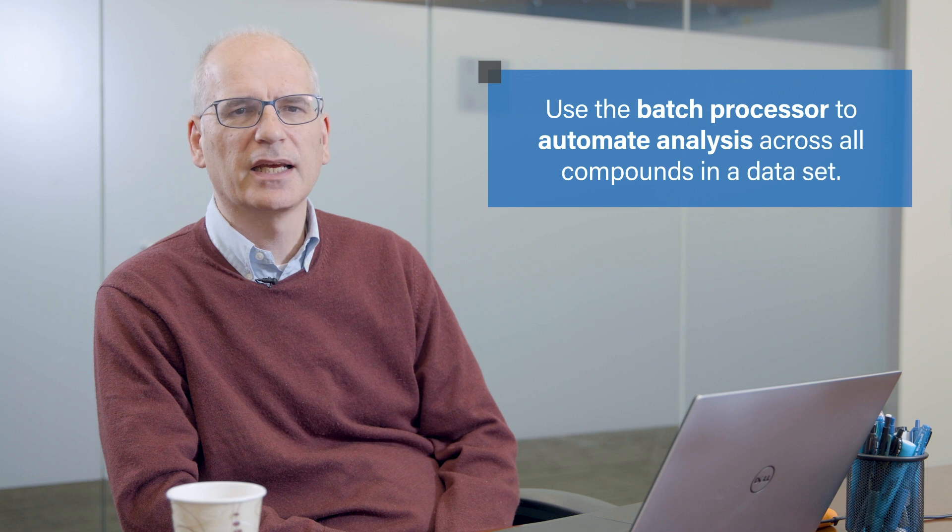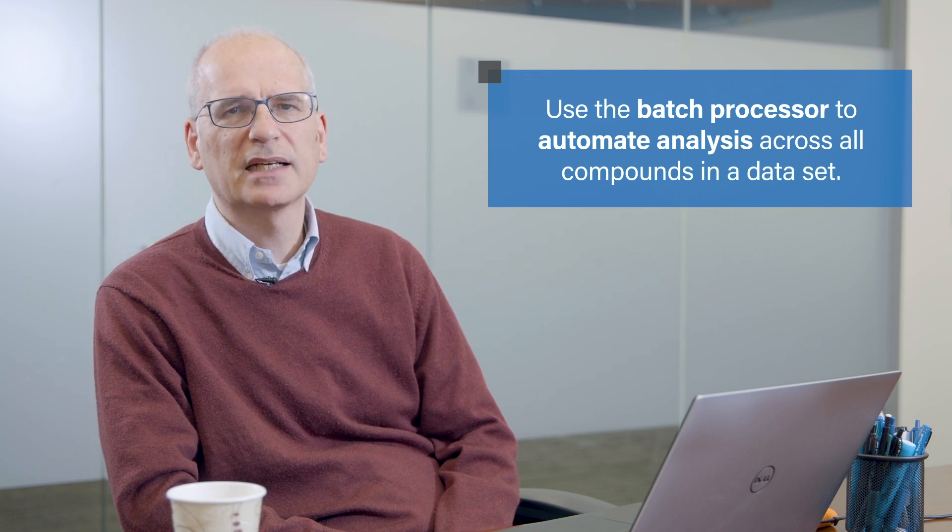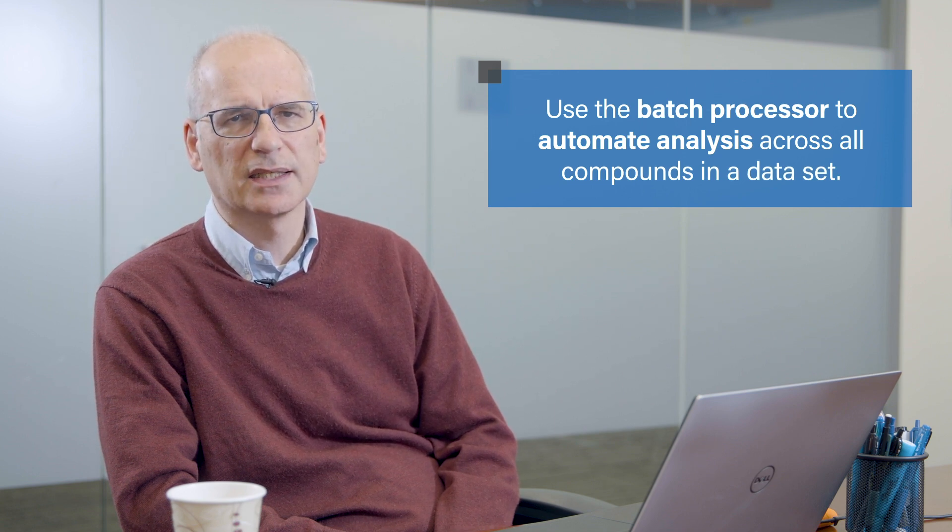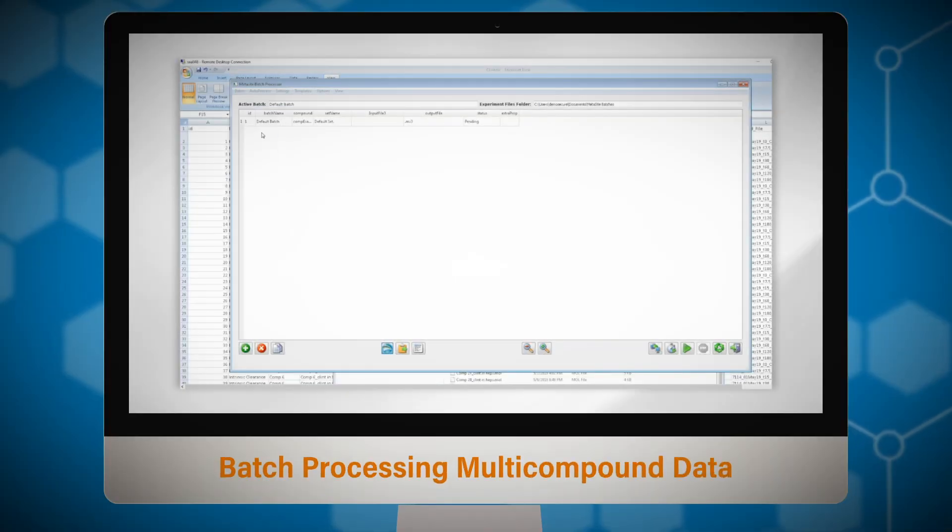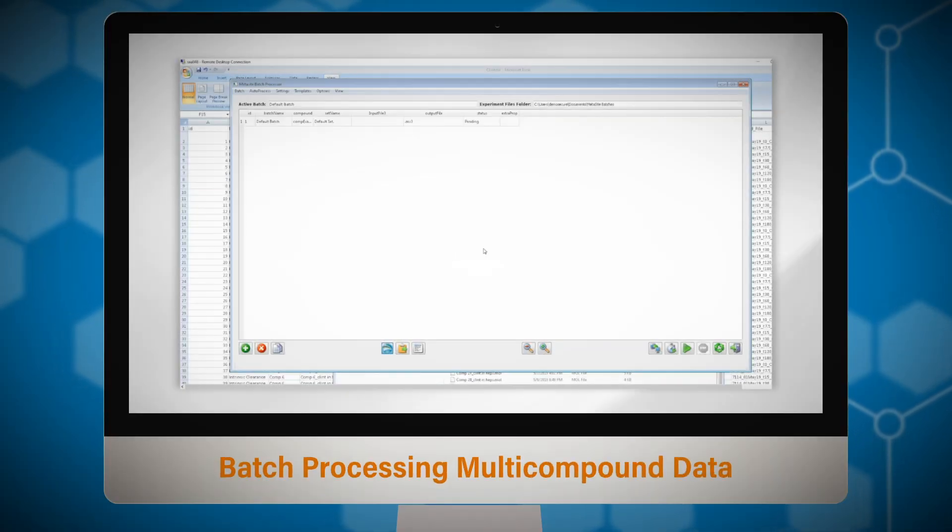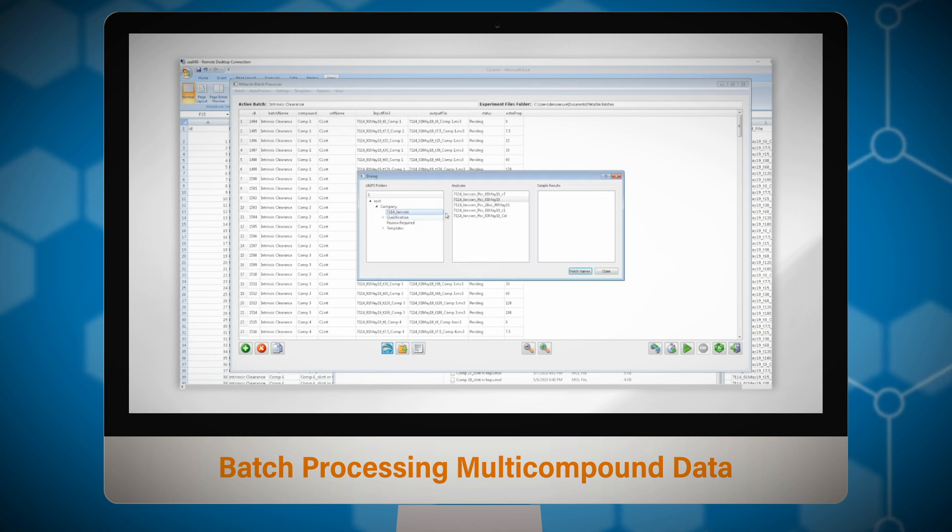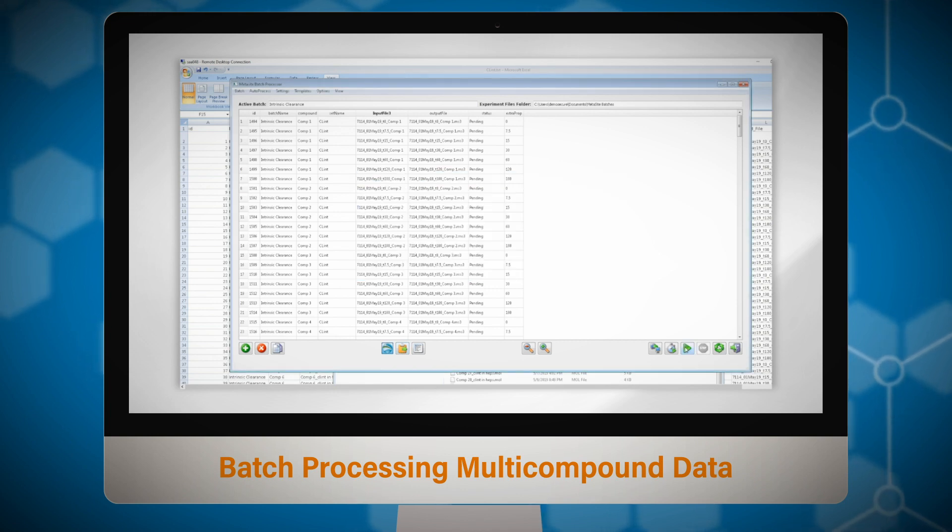What we've just seen is an analysis for one compound. When processing a full assay we use the batch processor to automate analysis across all compounds in the assay. The sample table can be automatically created for a 96 well plate and then populated with the relevant files via the connection to UniFi.